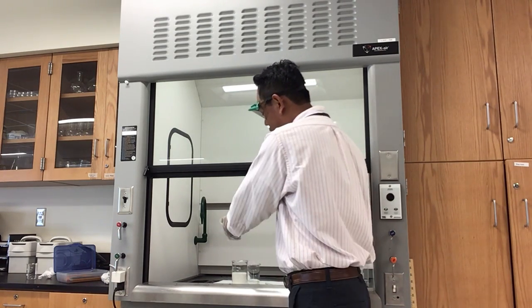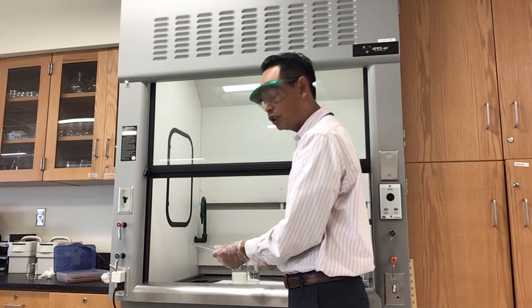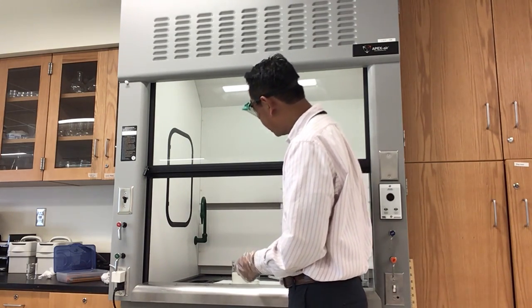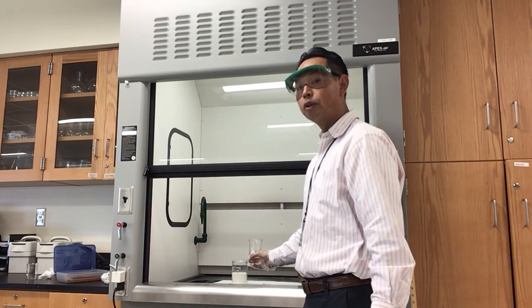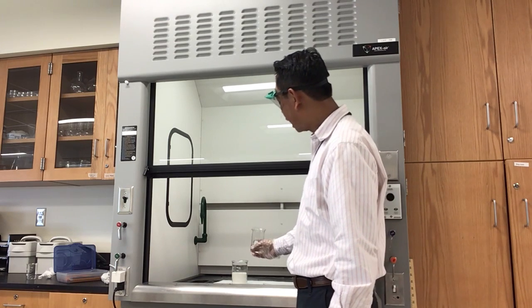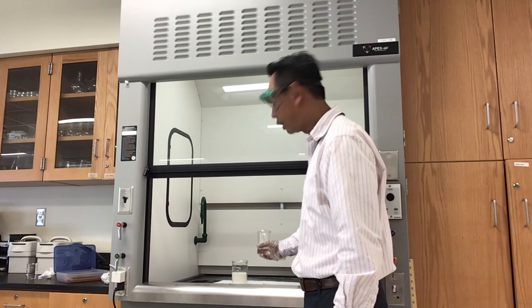So we've got pure sugar, and sugar, if you look at the chemical formula, is C12H22O11, or sucrose. Right? So what this is going to do is, it's a dehydrating agent. It removes all the water, which is the hydrogen and the oxygen. So what's left will be, we'll find out in a minute. Okay, so here we go.